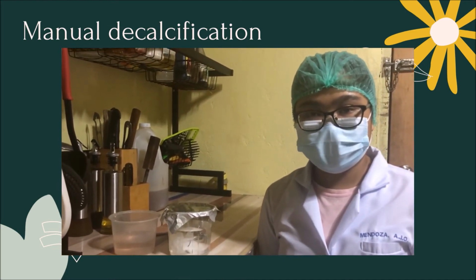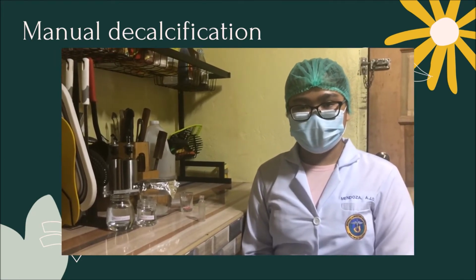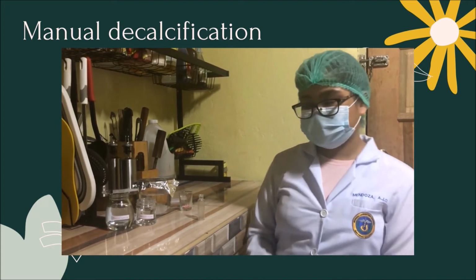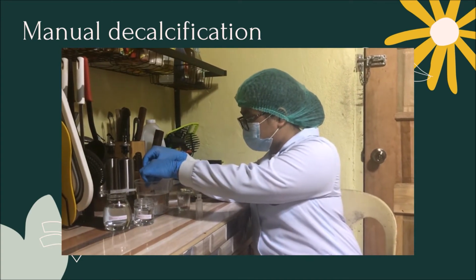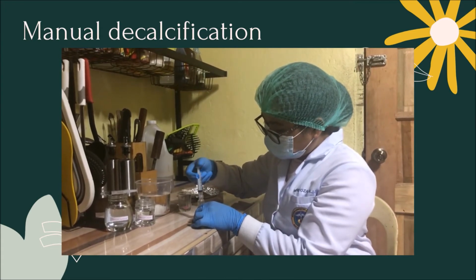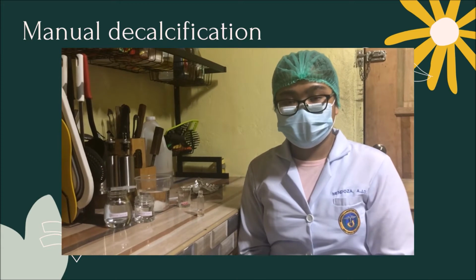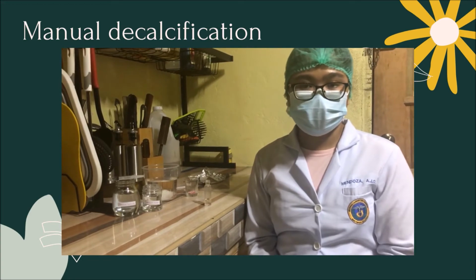Allow the tissue to decalcify for 12 to 24 hours. Now, after 12 to 24 hours, we will be testing the extent of decalcification. So first, we will remove 5 ml of used decalcification fluid from the beaker. Now, we will be adding ammonium hydroxide drop by drop to the solution until the pH of the solution becomes neutral.